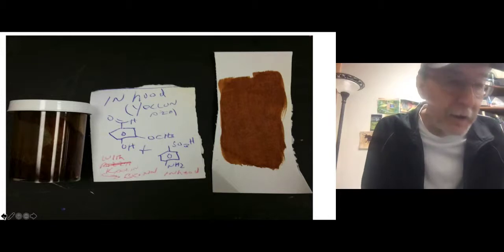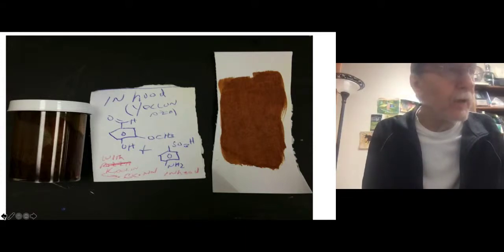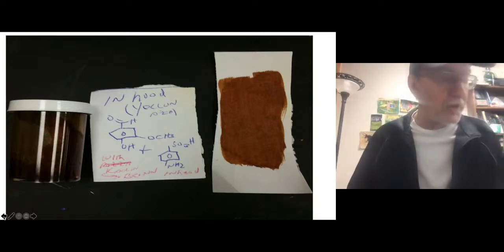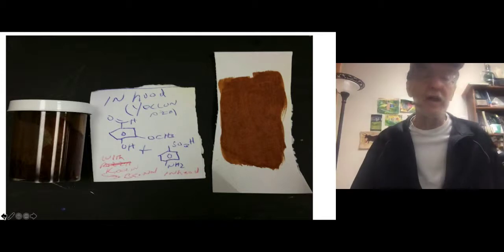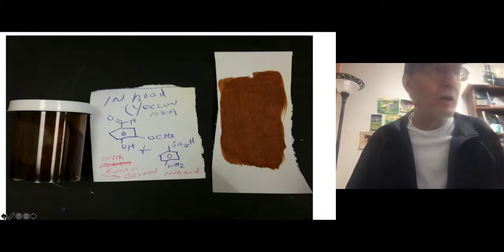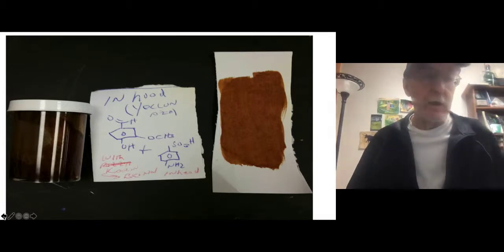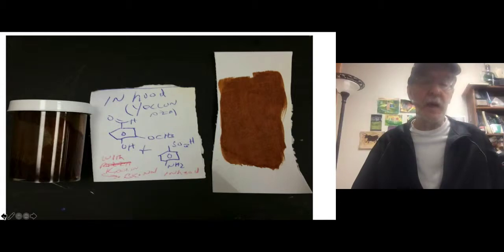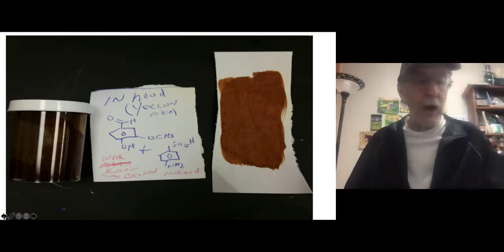Here I reacted vanillin. I pronounce it vanillin. Some people call it vanilla, vanillin. Vanillin, one of the characteristic odors of vanilla from the vanilla bean, and carried out a reaction with the para-sulfanilic acid, and produced the corresponding dye, and then blended it with kaolin. That's another story, but I look and work with kaolin dyes, the pozzolanas, such as what was found in the soil around Mount Vesuvius in Italy, Campania, outside Naples. The Romans used that to make concrete, and I work with a couple of mining companies in the western United States, so I'm also working with the kaolin families and blending the kaolin clays with these dyes, and I'll be formulating them, as I said, particularly in cold wax preparations.